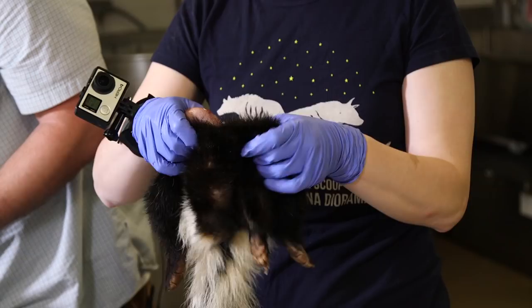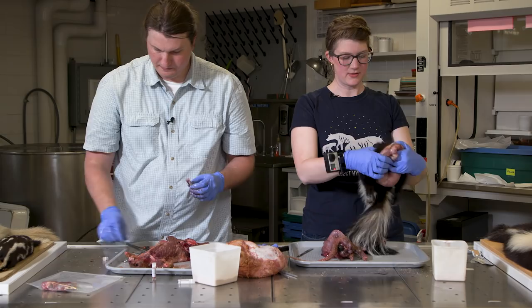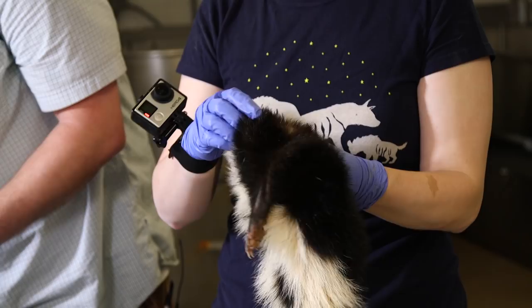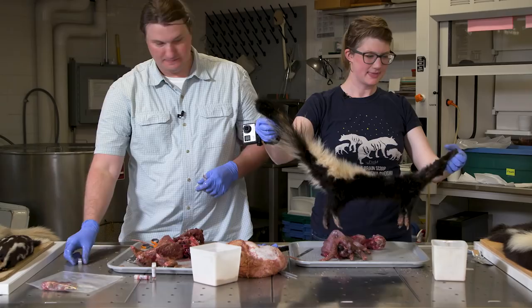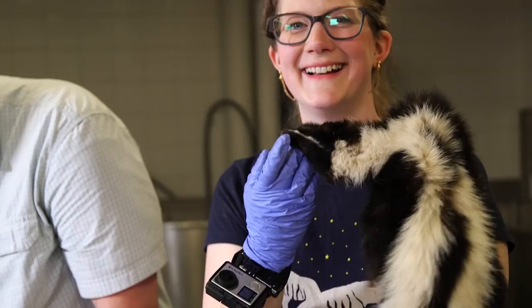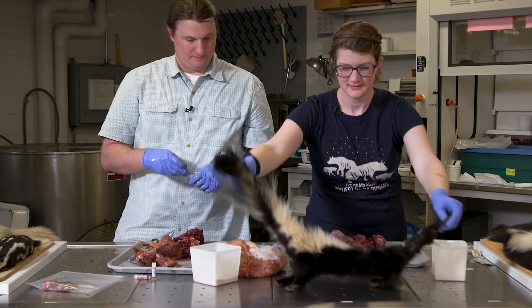Push one little paw through, find where the arm went — there — one little paw, get the face. Peekaboo. There's the skin — done! That was an adventure.